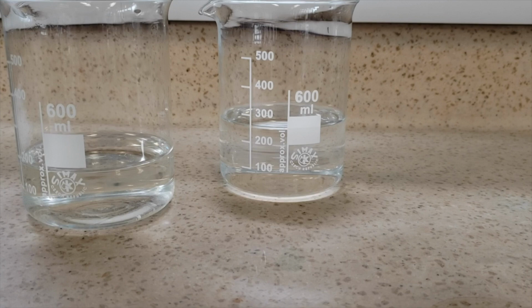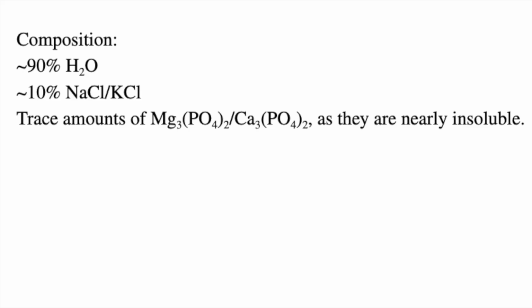So in the end, we got 2 solutions of sodium and potassium salts, and also a bunch of sediments. All the products should be biodegradable and also unusable by algae to grow, so it should be fine. So the question remains, is there a cheap and efficient way to deal with phosphate pollution? And the answer is a definite yes.